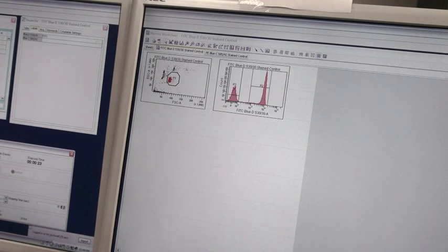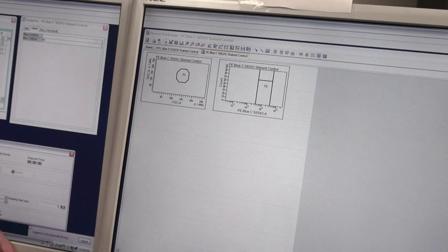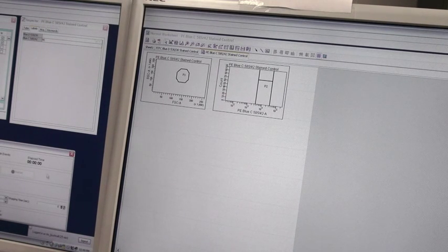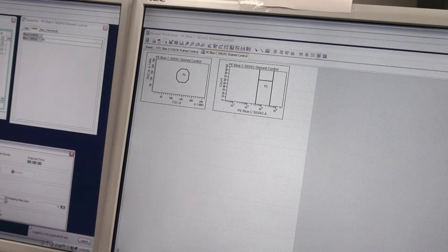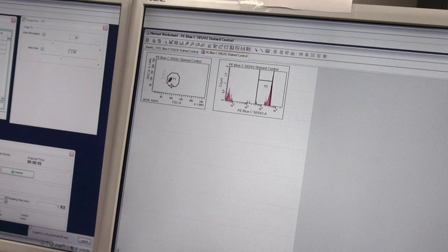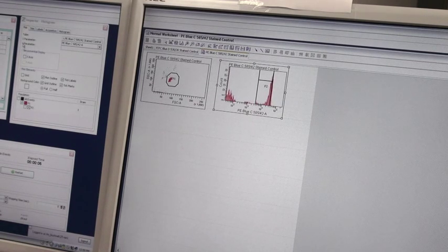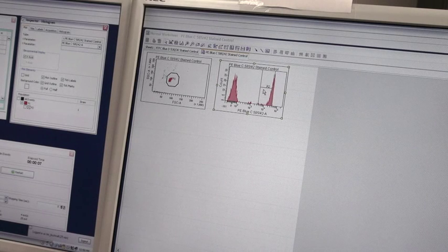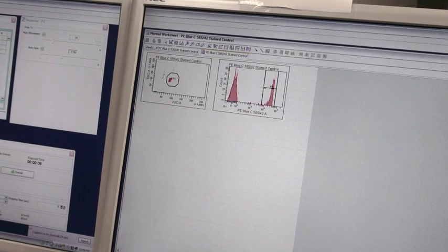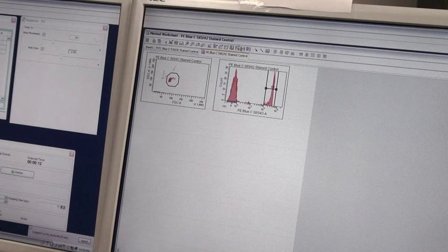Now that the system is done, we'll move to our PE control. As we load our PE control we see the same settings: a P1 gate and a P2 gate. The P1 gate is identified on forward and side scatter and identifies the cells of interest. Our P2 gate we will now move over to identify the positives shown here, and also need to capture the negative shown here.